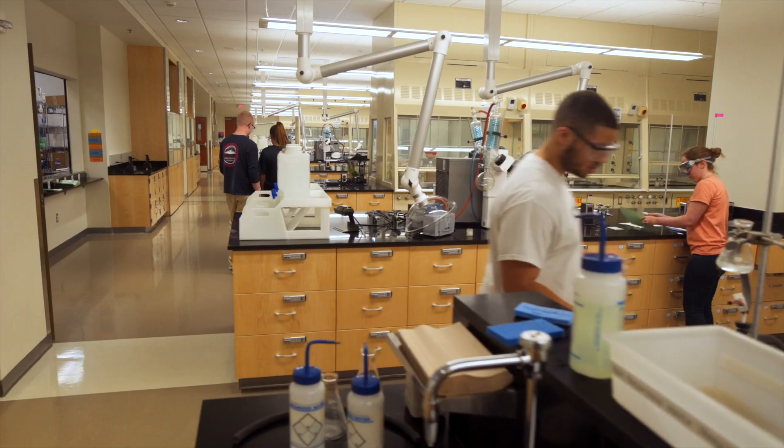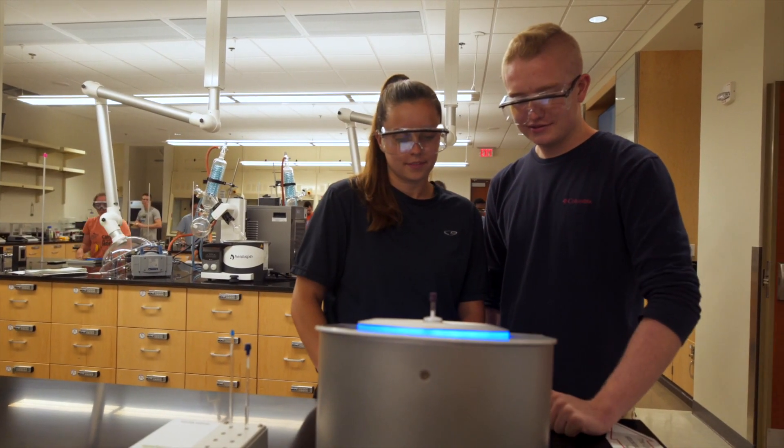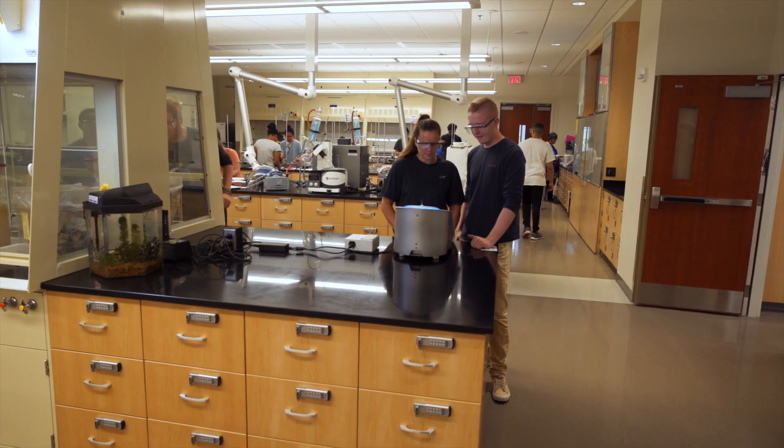We're really fortunate that we have one instrument for every 18 students with one TA, and so it gives us the opportunity to use the instrument pretty routinely within our lab curriculum.